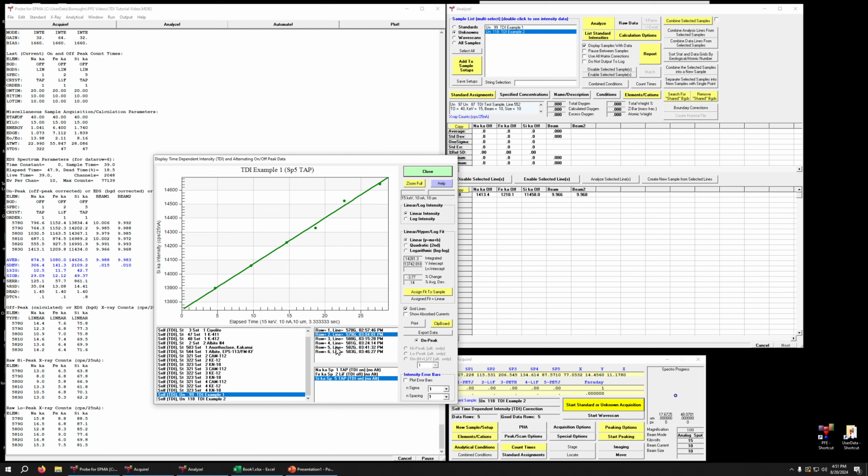So you can see that we actually need to make a correction for silica. We have almost a 4% change here in silica. As sodium goes down, silica goes up. So we would get poor results for both sodium and silica in this scenario, unless we correct for both.